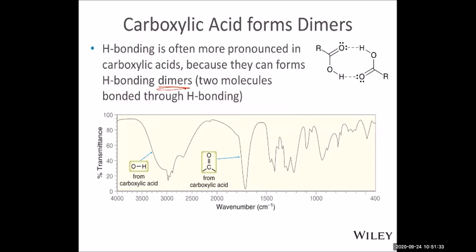And so by looking at this molecule, it's important to show all the hydrogens. Show all the hydrogens. This is a methyl group. And here we have one more hydrogen. So keep in mind, in the infrared, a hydrogen oftentimes tells us very strongly about the structure. Because hydrogen has a lower atomic mass, the frequency is oftentimes in the higher frequency range, at least 2000. And that can tell us what kind of structure the molecule has. And then we have carbonyl and OH.